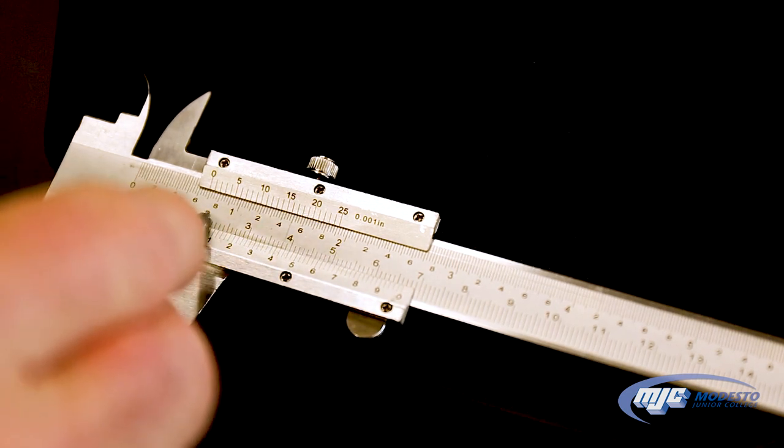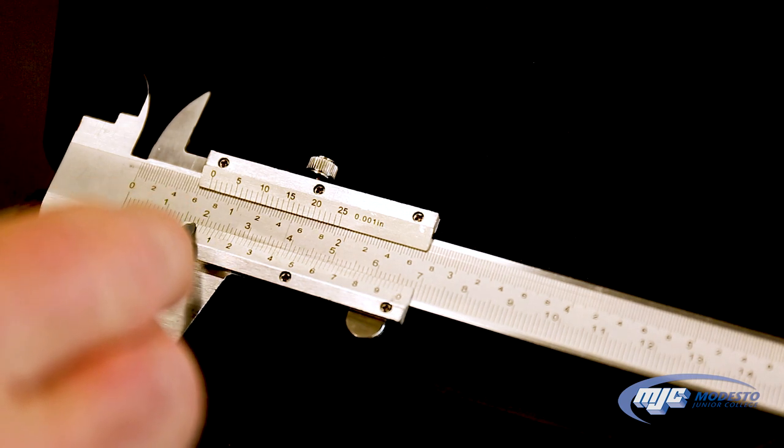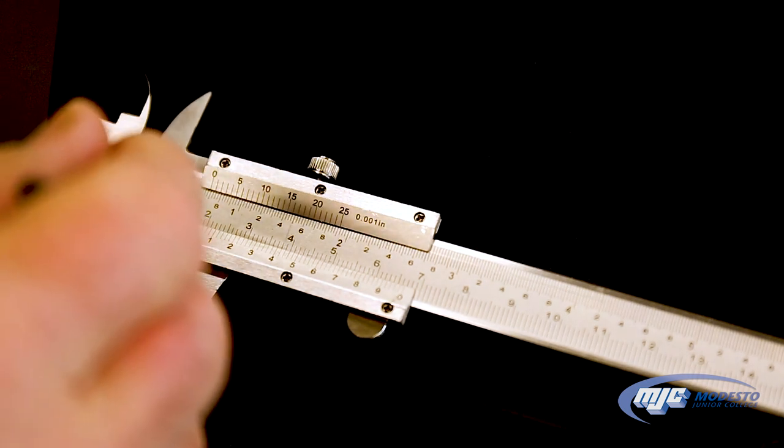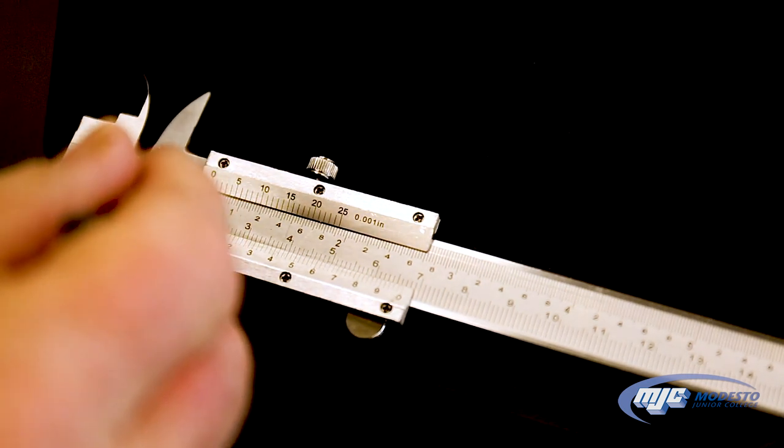Zero, one, two. So this line above the zero is between one and two centimeters. Next we go down a little bit farther and say, okay, each of these small lines is 0.1 centimeters.